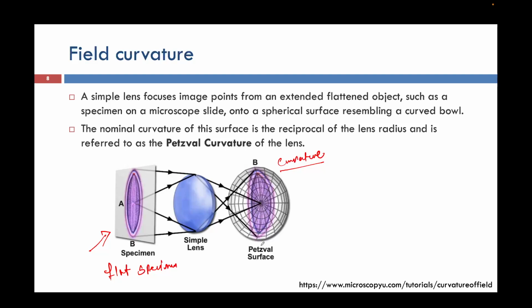So that means, let's say I am analyzing some unknown samples, right? If I put them under the microscope and I see this kind of structure, then I will say that this sample is a little bit curved, and my analysis will be completely wrong, because I do not know the sample. But why has this analysis become wrong? Because this lens has this field curvature effect.